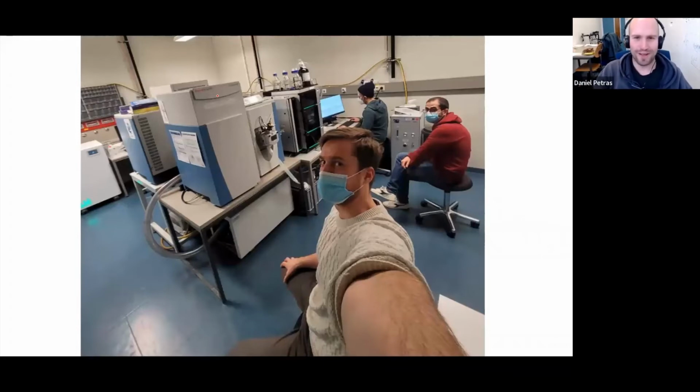Otherwise we could now all walk over like we did with Raphael and Paolo a couple of weeks ago, and actually go to our instrument, right? And for the next 10 minutes or so, what I want to do is remote connect to our instrument and analyze a sample with you and play around a little bit with those settings I just presented, so you get a feel for how it looks.